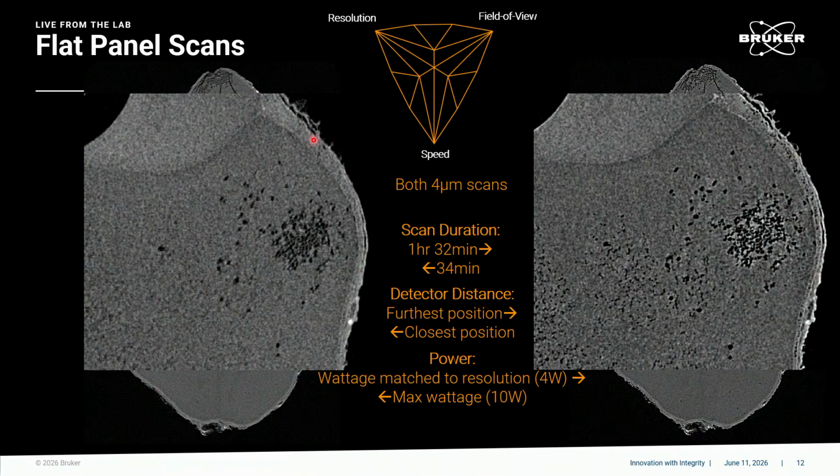The outer shell of the almond, you don't even see structure to it. You don't even see the voids in that shell on the left. You might get a suggestion, but it's not there. The other one is the contrast. How sharp that contrast is from the top material to the bottom material, on the right versus the left.